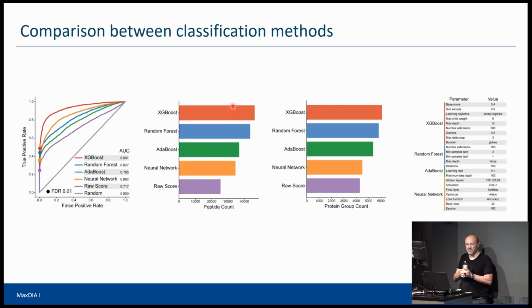So now we give new masses to the decoy spectrum, which is based on this reversal of the sequence. In MS2? In what? Fragment ions. Yeah, in the fragment ions, exactly. A good comment.